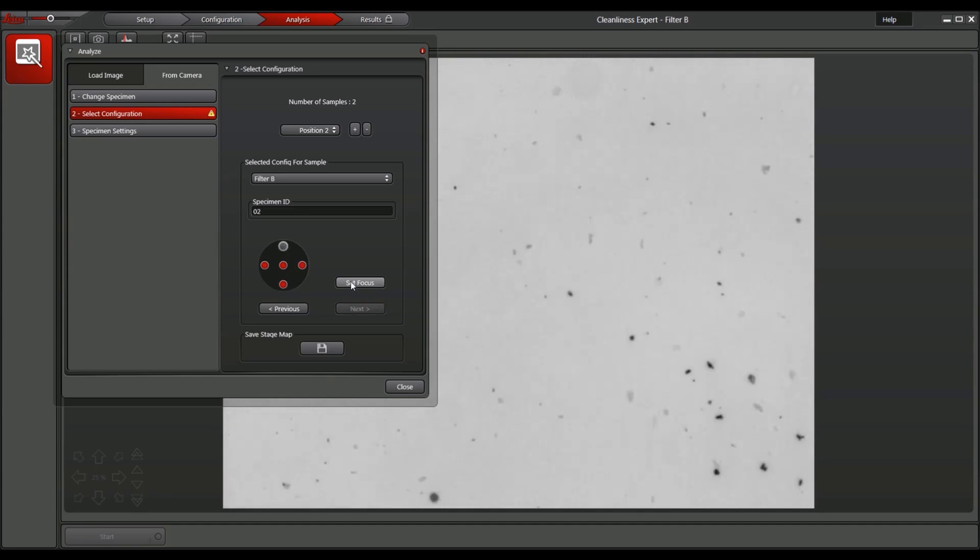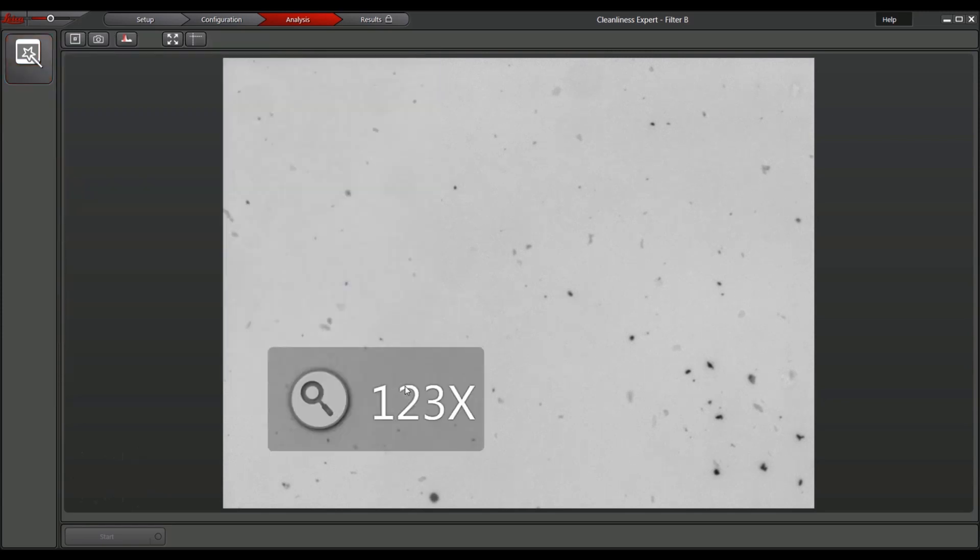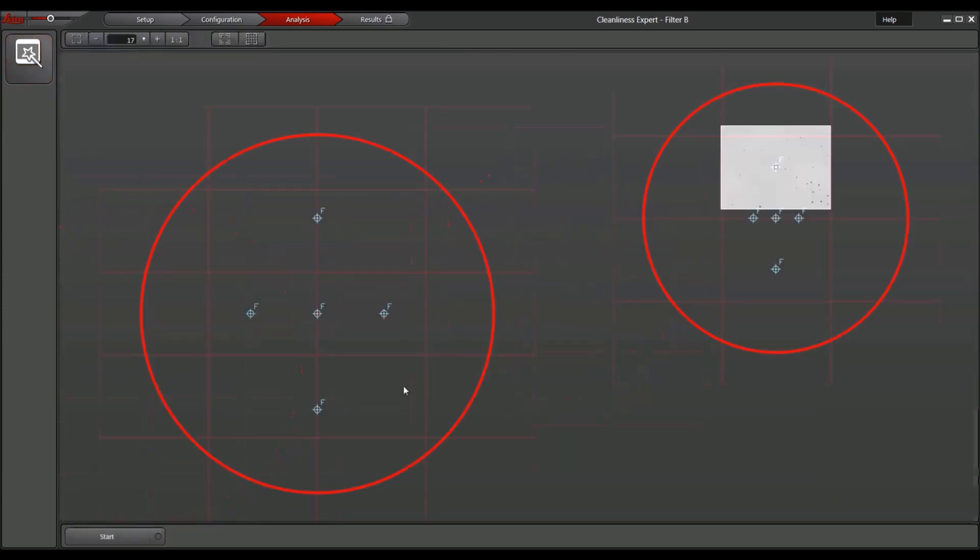Enter the specimen ID and check the focus. Finish the analysis setup by closing the window. The stage map showing the focus positions and areas to be analyzed will automatically appear.